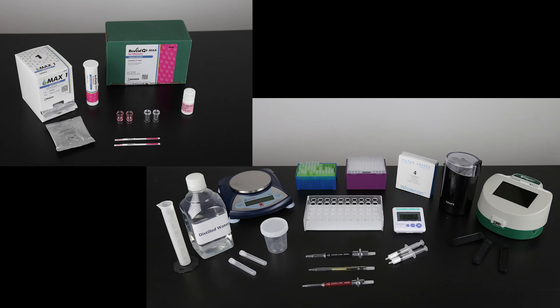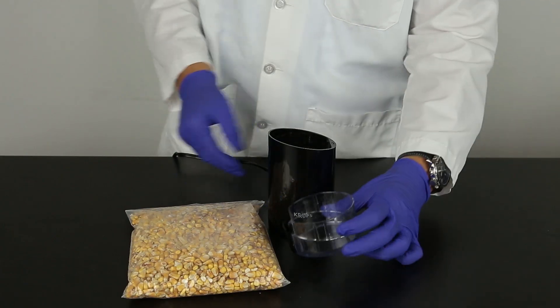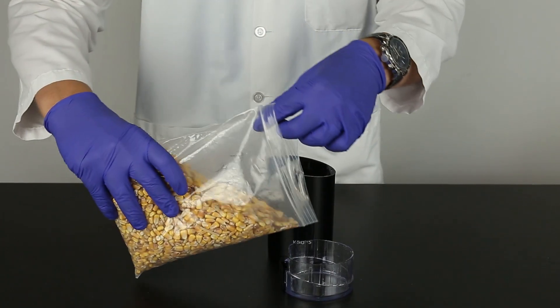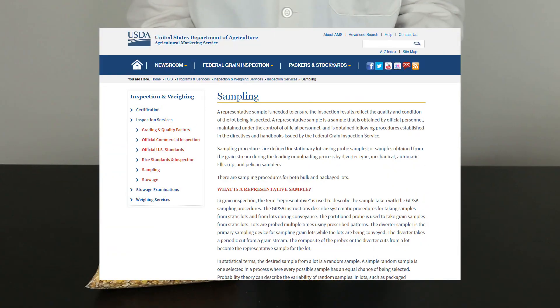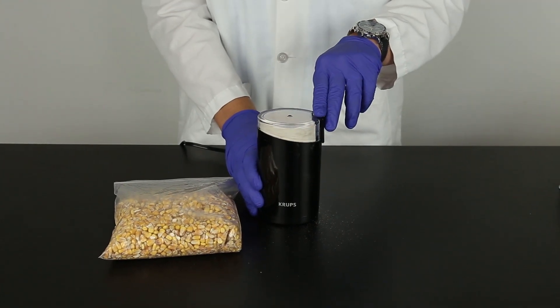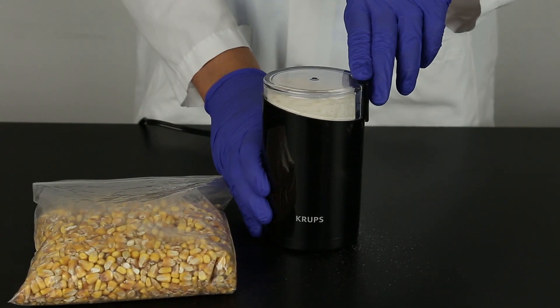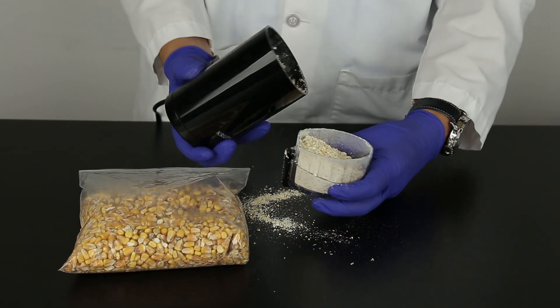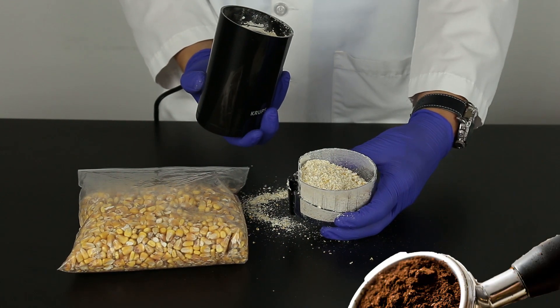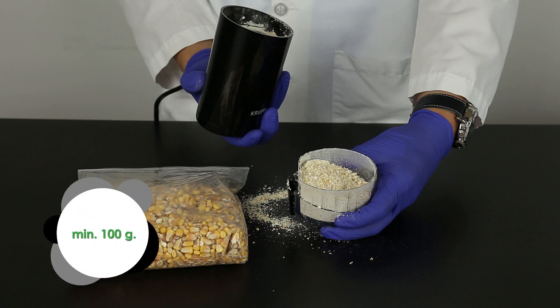To prepare the sample, begin by gathering all the materials required. The sample to be tested should be collected according to accepted sampling techniques. See the FGIS sampling protocol or contact your Neogen representative. Obtain a representative sample and grind so that at least 95 percent of the ground material passes through a 20 mesh sieve. The particle size should be about the same as espresso. It is best to grind a minimum of 100 grams of your sample.